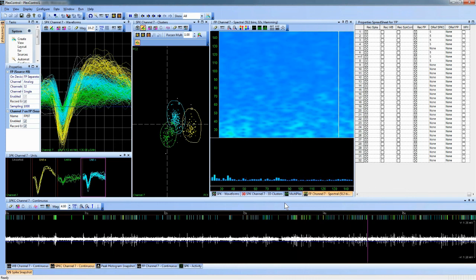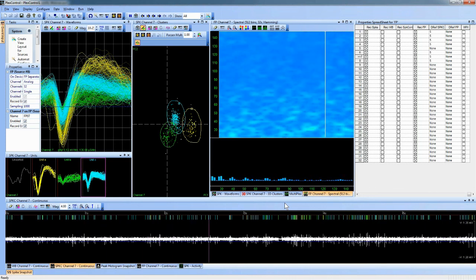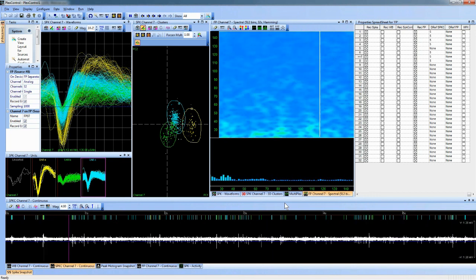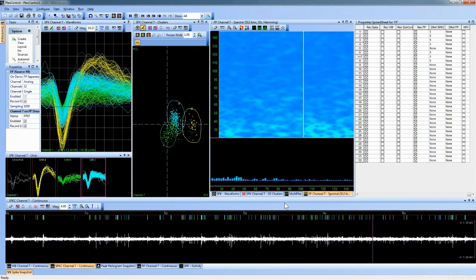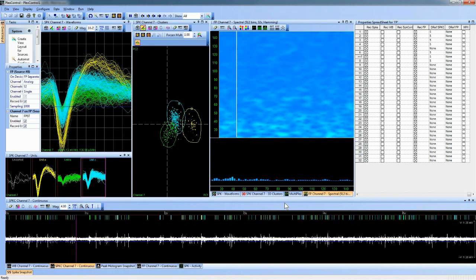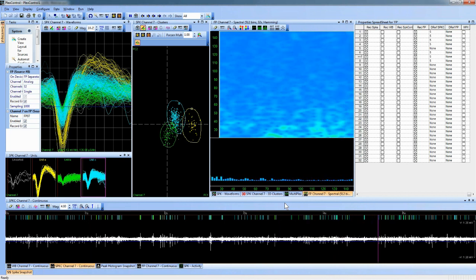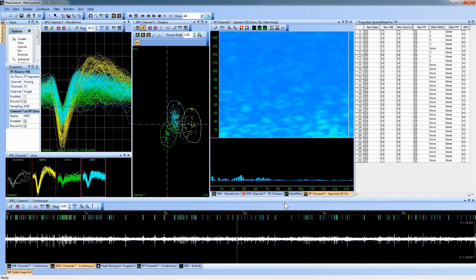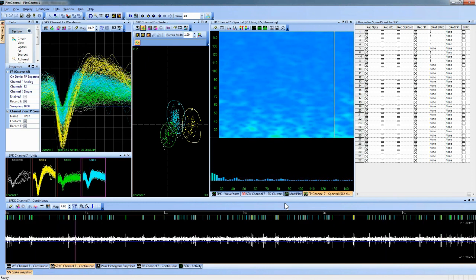So saving the wideband data effectively allows the user to save a raw, unchanged copy of whatever you did to the channel online. So if you did all kinds of thresholding and extractions and sorting and referencing and all that kind of stuff, and potentially wanted to undo some of that afterwards, you could undo that or make different changes if you also had the wideband data.